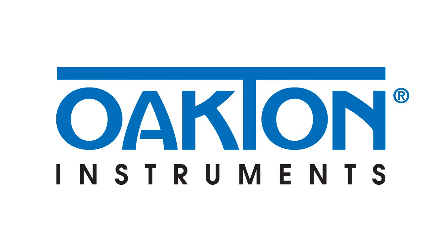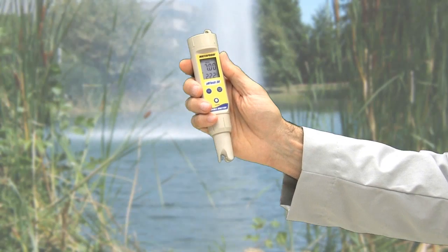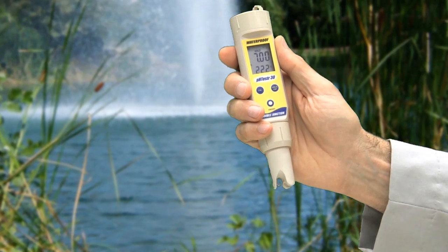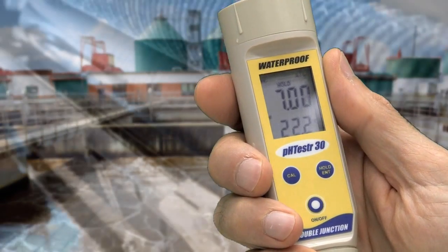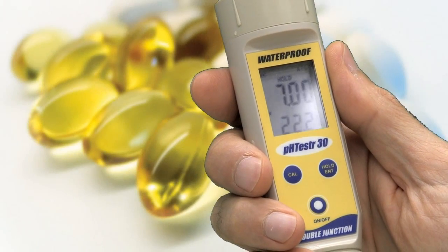Innovative and intuitive, the Oakton Waterproof pH testers meet demanding applications in laboratories, water treatment plants, industrial sites, and pharmaceutical facilities.